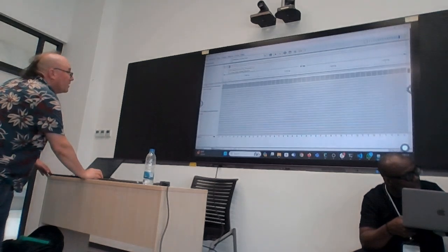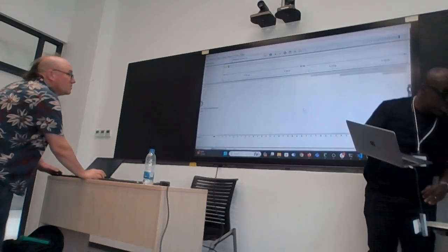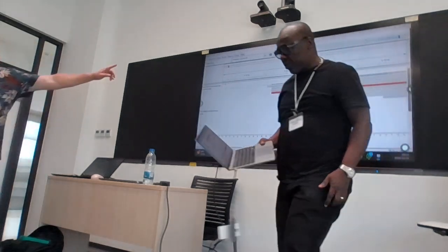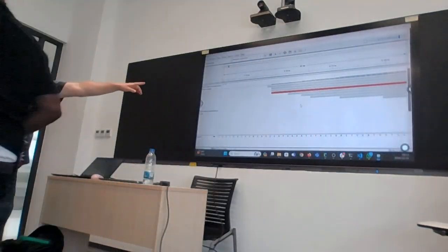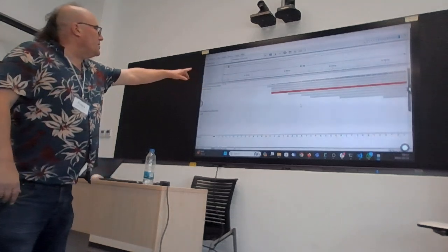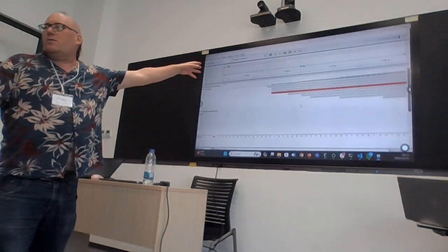I'm just trying to find where this starts. There. This one, participants. That's what you're talking about, Stephen. Here we can see this position. There's no data there.